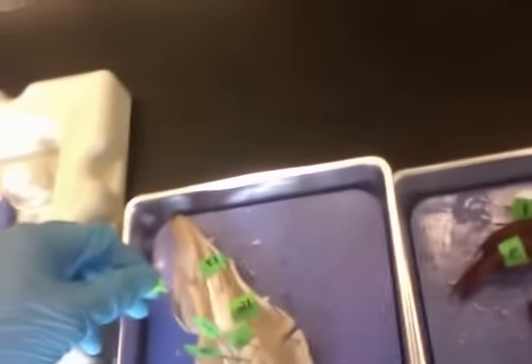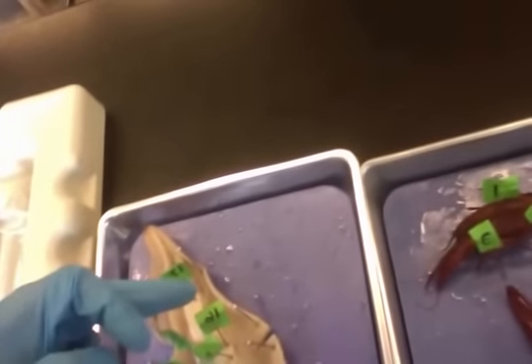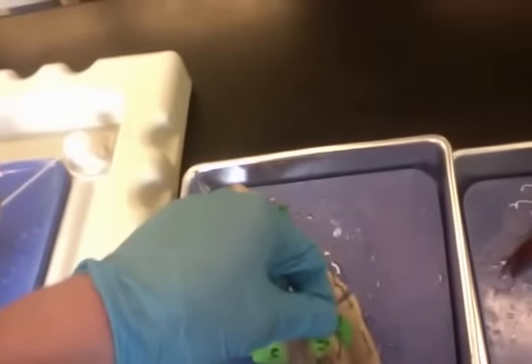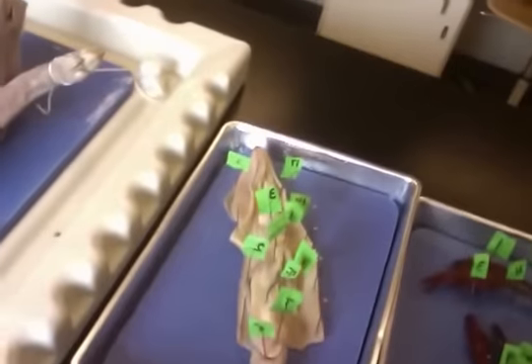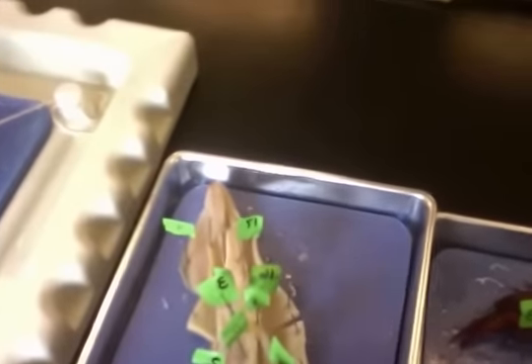Moving on to the male squid, we have the caudal fin, the spermatophore sac, we have the testes right here. 1 and 1 are the branchial hearts. 3 is the systemic. This guy right here is the mantle artery. 2 are the gills. This guy right here is the penis. 7 is the siphon. 5 is the head. And 6 are the tentacles. That is the male squid.